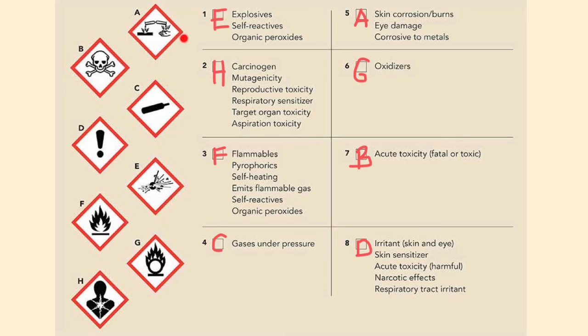All these labels are a must to know if you work in a laboratory. It may save your life.